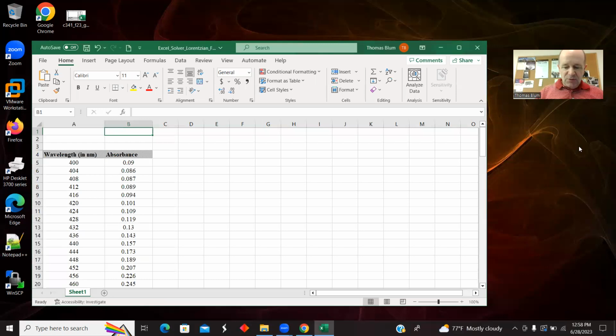And those parameters, one of them is going to correspond to the peak's height. One of them is going to correspond to the peak's position. And one of them is going to correspond to the peak's width. It's really the half width at half height. And so the height is a y, and these are both sort of x's. And this form mathematically, let's just put in, I usually just start with 1, 1, 1, which are going to be terrible values, but we're going to do better.